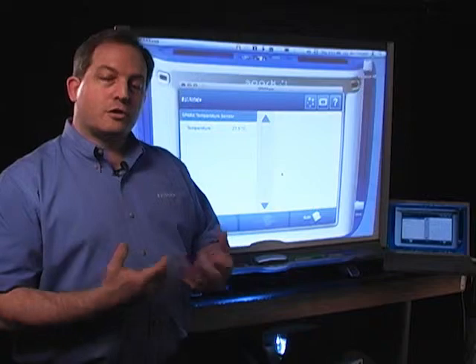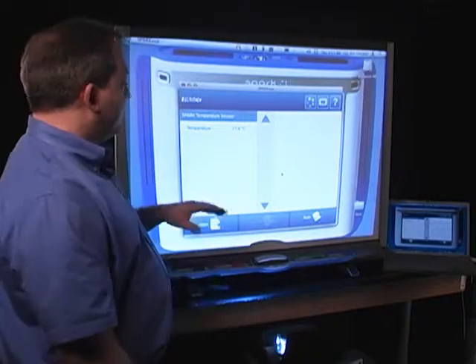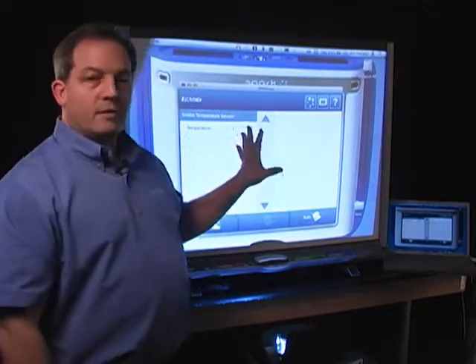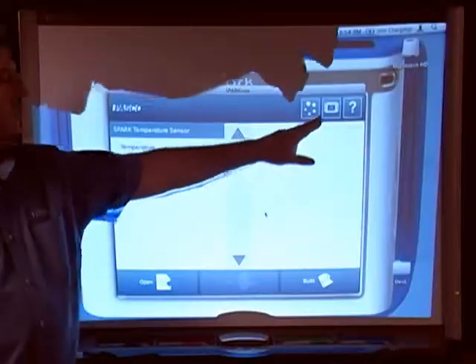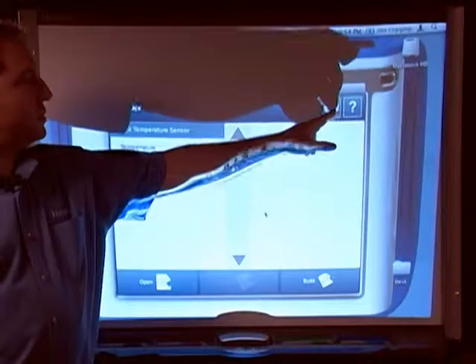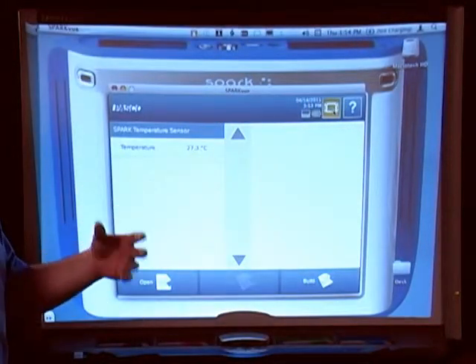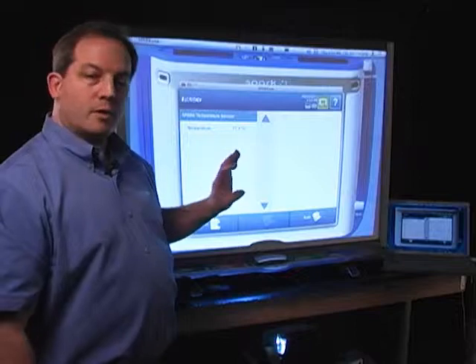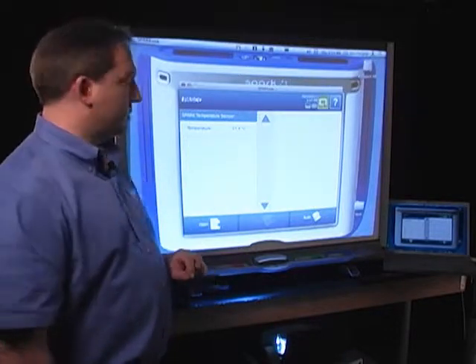There are two different versions or two different ways you can use this software. I can use it as I have it now. This is the SparkView, the full version of SparkView. I can also use it in emulation mode. And what that's going to do is it's going to mean every touch here is going to be one for one with what's going on on the screen of the Science Learning System.